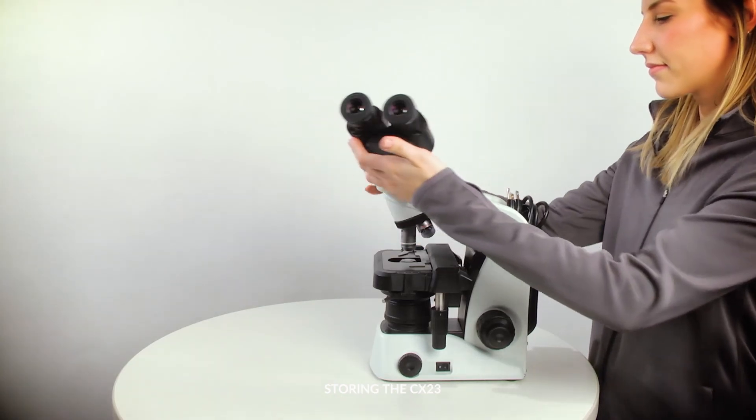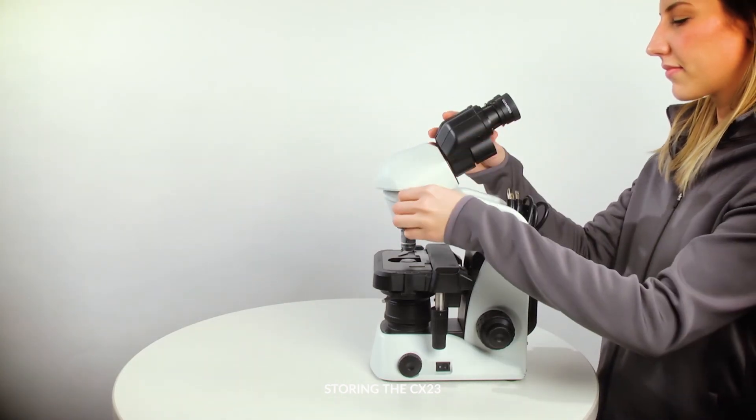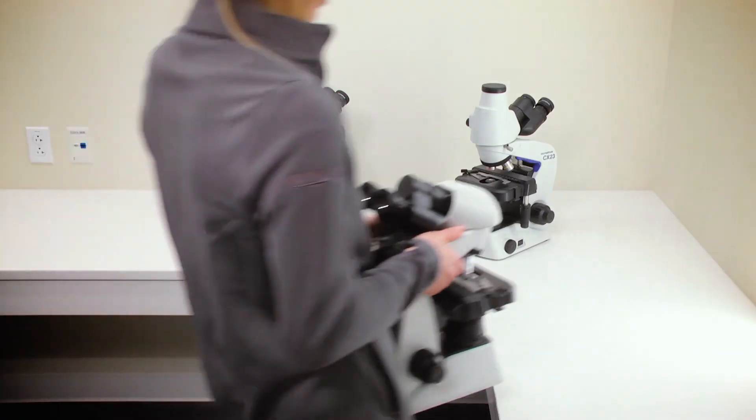Rotate the observation head. Lift the microscope using the blue ergonomic carrying grips and carry it to its storage place.